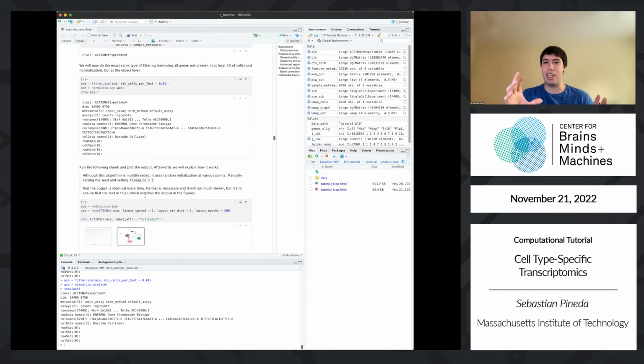We're going to create a new representation, and then we're going to use that representation to construct a network using an algorithm called K*N. And this network, just like the network we use for UMAP, is basically going to tell us how similar every cell is to every other cell. But instead of just doing the Euclidean distance, which is what most of these algorithms do, right? They just take the Euclidean distance. We can do better than that.